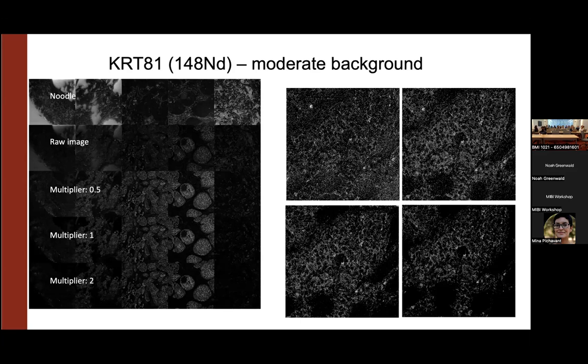Okay. So are there batch effects that you see for Rosetta across different slides? Across different slides, I don't think we've observed that. When we sample the random FOVs to evaluate how the default coefficients are working, they do get sampled across different slides, and we have not come across that.